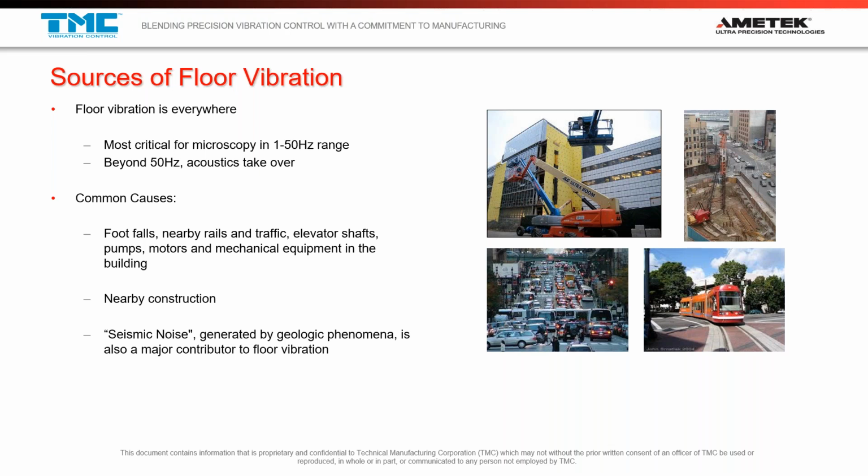And if you have a geophone sensitive enough, you can place it on the ground anywhere in the world and find a 0.3 hertz vibration due to the sum of all the waves crashing on all the shores in the world. That's called the microseismic peak. And we have customers that have instruments sensitive enough that this 0.3 hertz from waves crashing miles away is causing them problems.